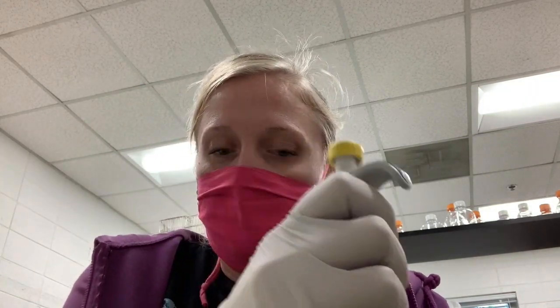And remember, this is our ATP, our GTP, our CTP, and our UTP, because RNA has different nucleotides than DNA. So they would be ribonucleotides instead of deoxynucleotides, and then you would have U instead of T. Okay, so I've added those 2 things to my master mix. I'm going to go to the freezer to retrieve my enzymes.